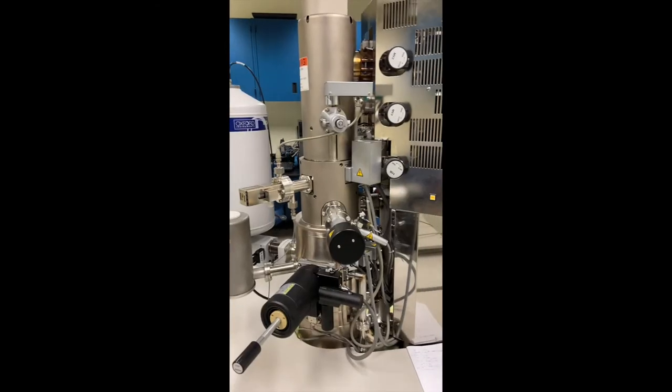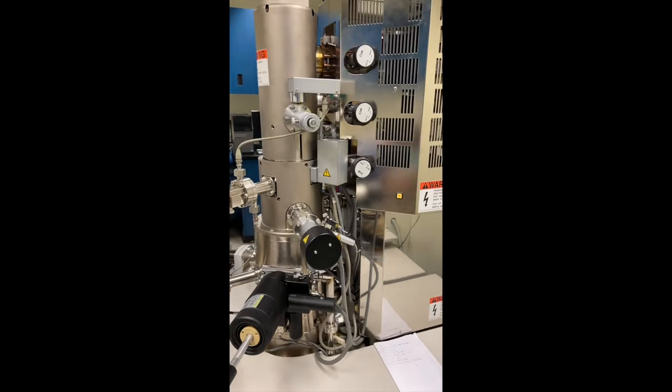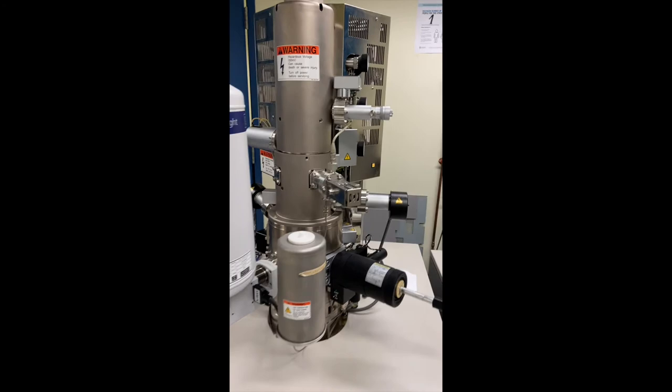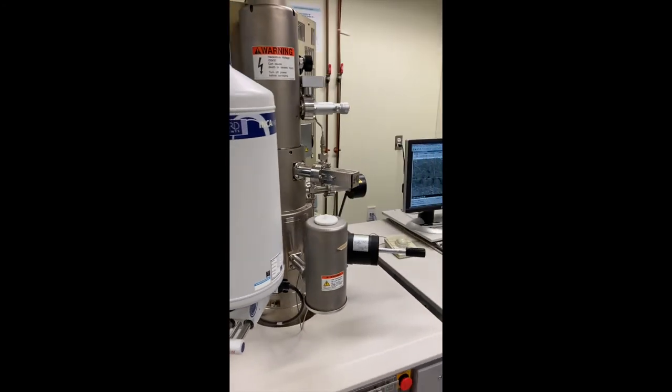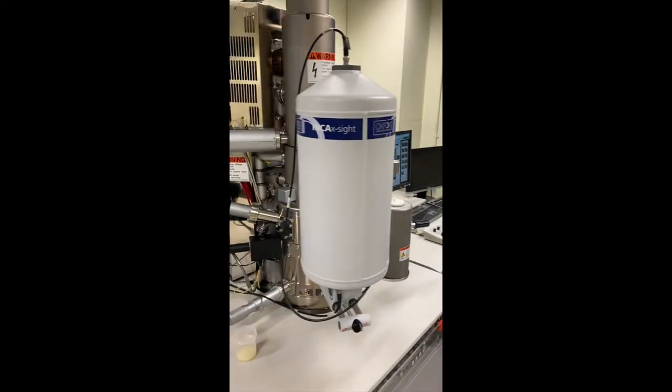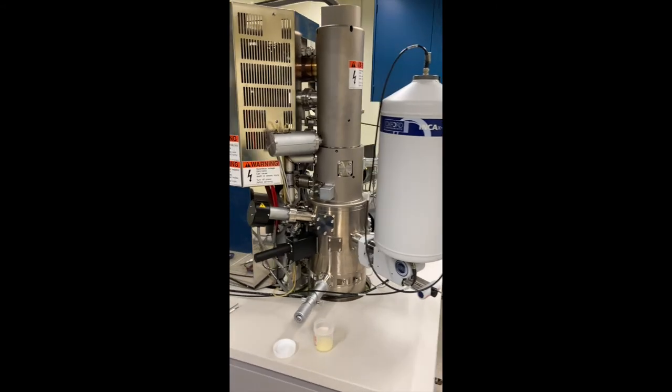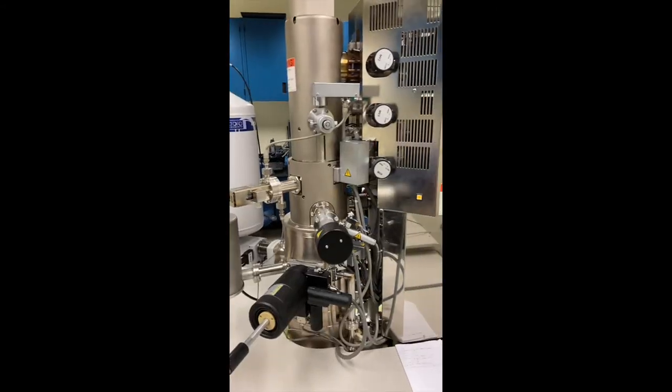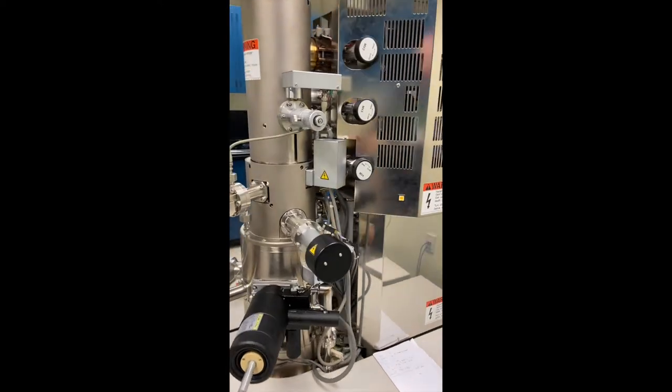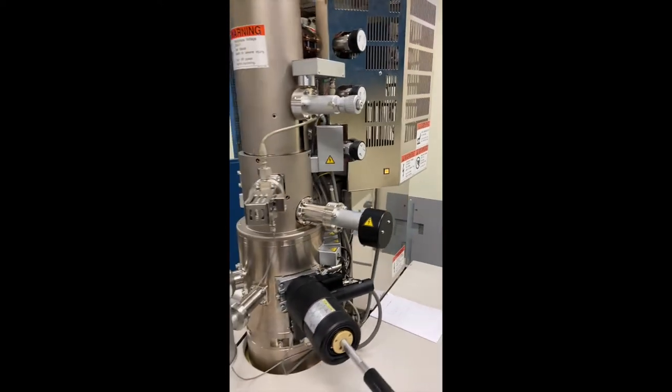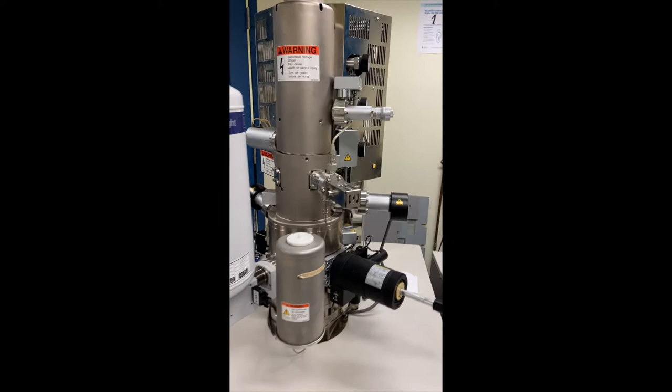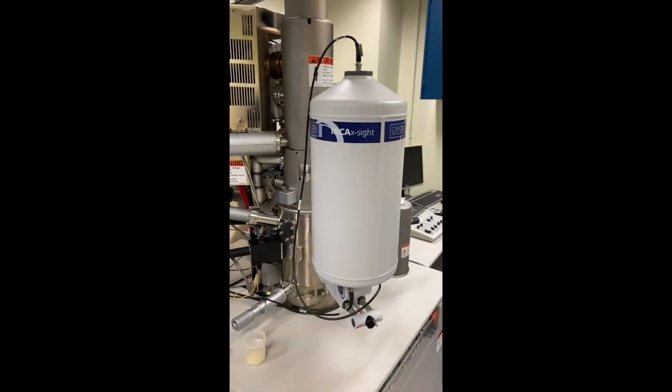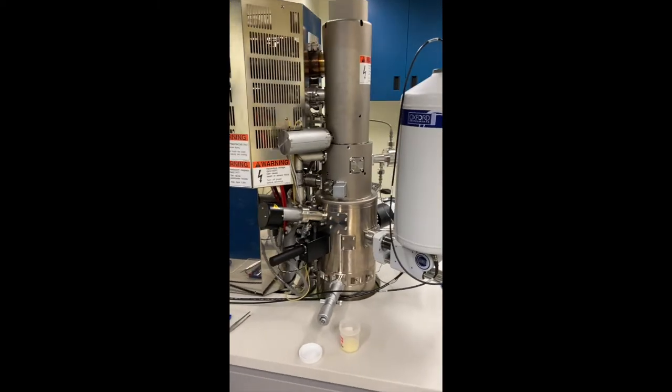First, it's very strenuous on the facility to have a high-powered vacuum generator for many different instruments. Also, several samples aren't content being in a high vacuum. The ones that come to mind are aerogels, hydrogels, and biologicals—things that would collapse if the pressure keeping them afloat isn't there. And so it became very difficult to study these types of systems using SEM.